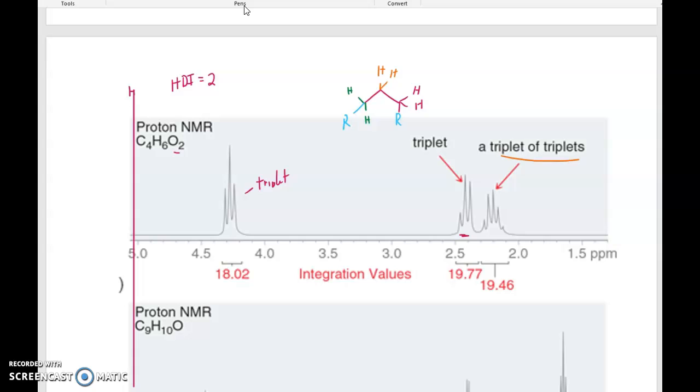And then the green ones here, if we take that these are the green ones, they are downshifted a lot. So perhaps one of these oxygens is involved. So let's put, I'm going to replace this blue and just say that's going to be an oxygen. And that'll account for the downshifting here. On the other side, we are still minus a carbon.